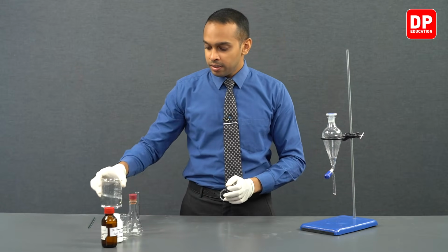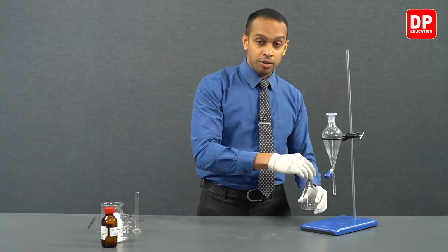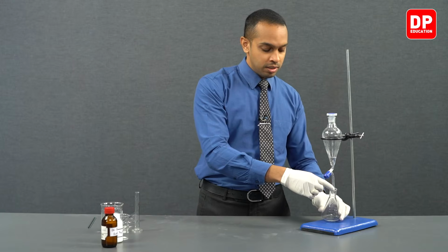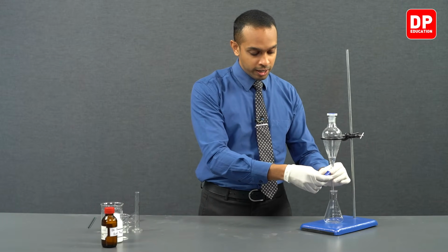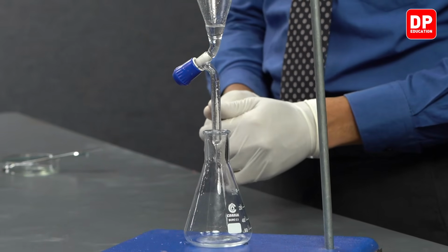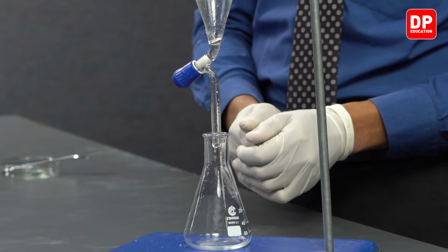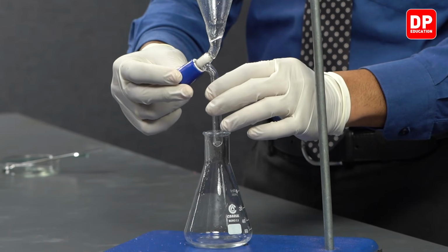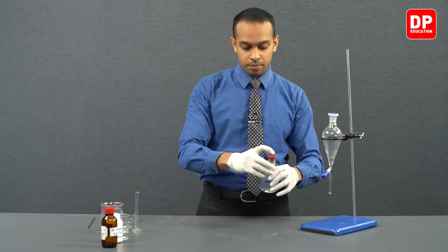We can now take our Erlenmeyer flask that we collected our previous diethyl ether layer into, and we can allow this diethyl ether layer to get collected into the same Erlenmeyer flask where we collected our previous diethyl ether layer too.